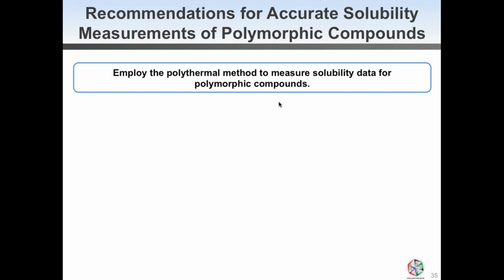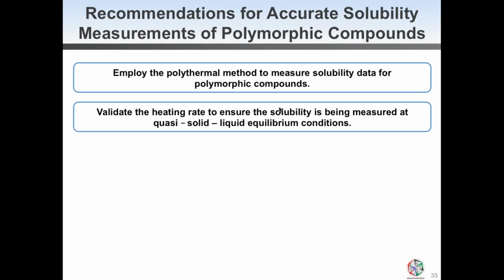However, in order to employ a heating rate, we need to ensure first that the heating rate chosen is validated in order to ensure that we have quasi solid-liquid equilibrium conditions. And Vilmali has shown you very nice examples of how we can do that.